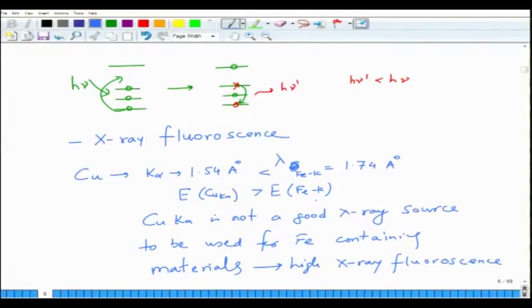As a result, the X-rays get absorbed, emitting secondary X-rays, and they lead to higher noise in the data, and hence a weak signal of the X-ray pattern.